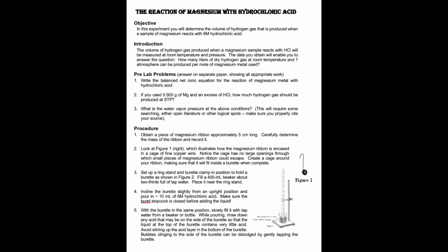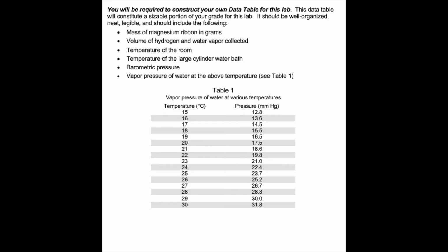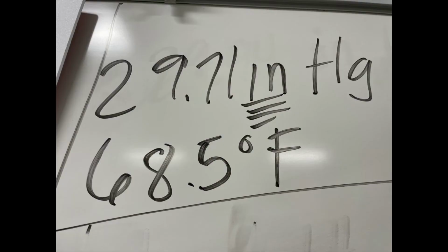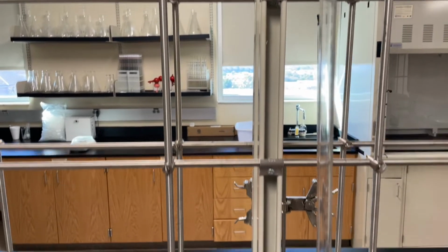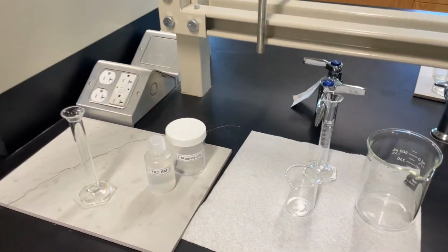Welcome to 2045 Chemistry, Production of H2 Gas. In this particular lab, we'll experiment with various ideal gas laws, the combined gas law, and Dalton's law, in order to capture H2 gas in a chemical reaction, but then determine exactly how much hydrogen gas we have captured. We'll deal with water vapor pressure. We'll also calculate moles of hydrogen and grams of hydrogen gas.